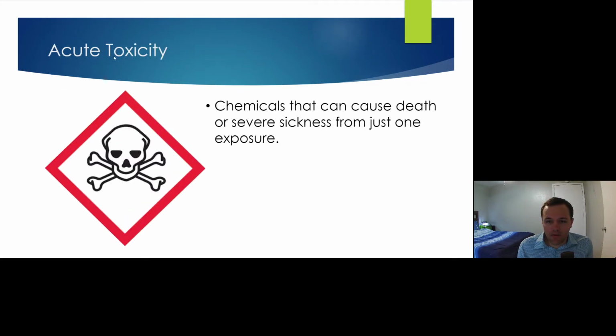All right, this one here, the skull and crossbones. Again, you guys probably could have guessed what this means. This is acute toxicity. So what that means is if you are exposed to this just one time, it can cause you to get really sick or die just from that one-time exposure. It doesn't have to be prolonged over a long period of time or anything like that.